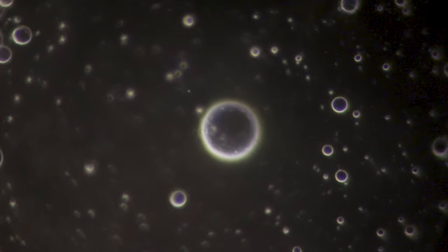The oil droplets bounce the light differently under the bigger magnification. This droplet contains folic acid, omega-3, magnesium, potassium, lutein, and vitamins A, C, D, E, K, and B.